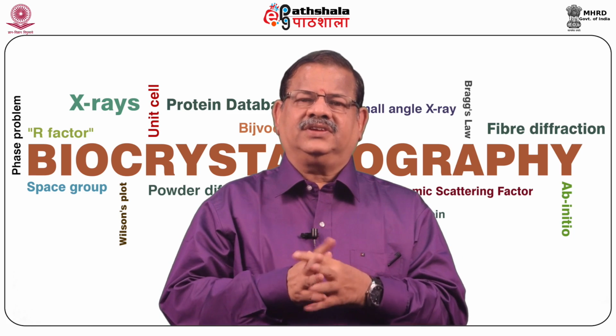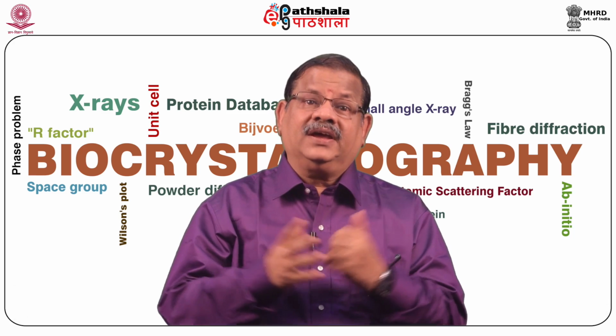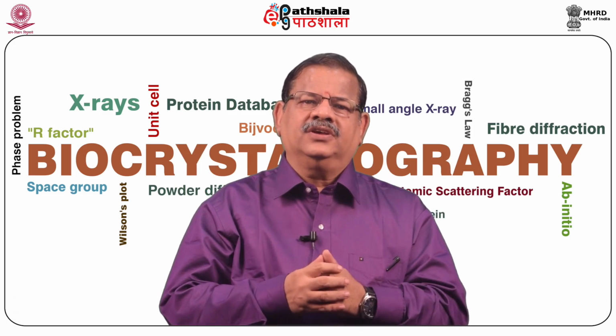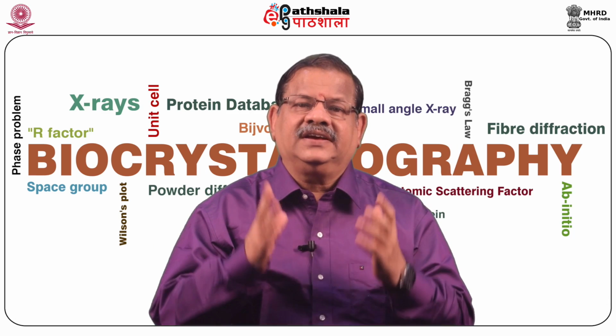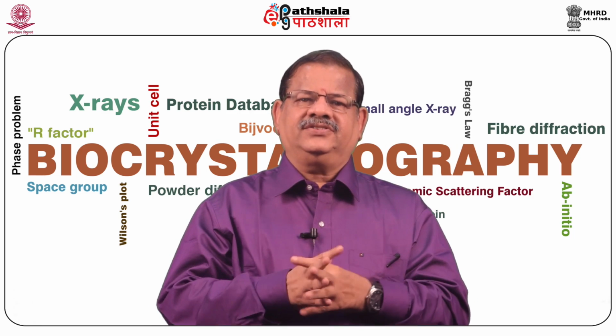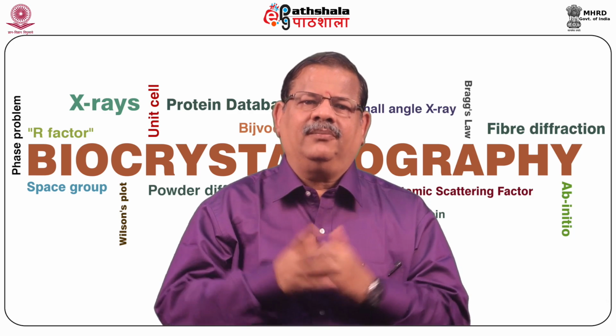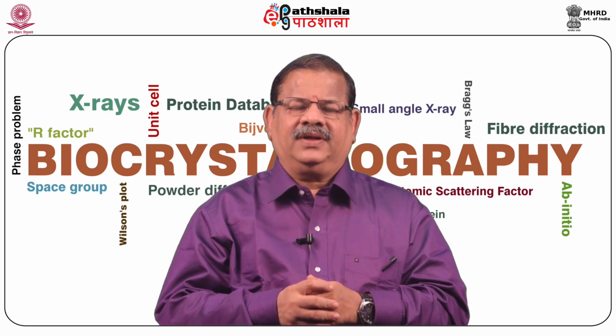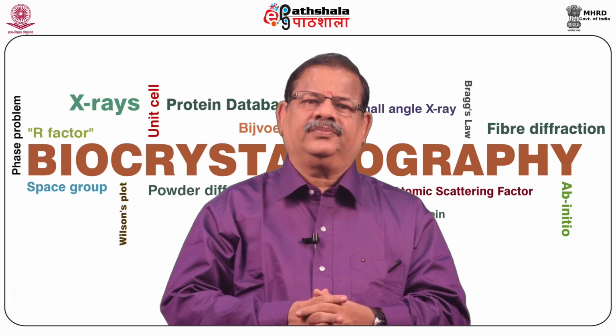During macromolecular structure determination, one may have to use many software packages and repeatedly use interactive three-dimensional graphics. A comprehensive system for the above problem with automation of all procedures has been developed as the Phenix suite.